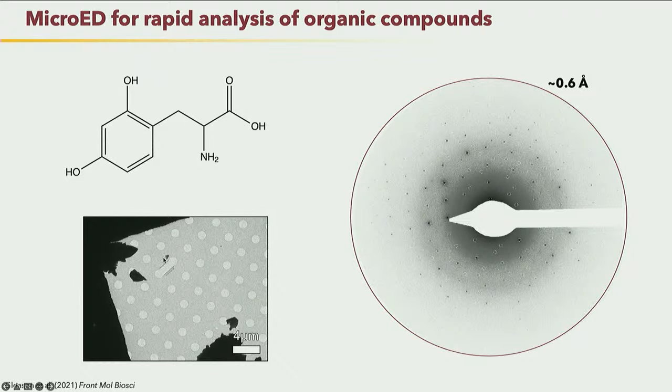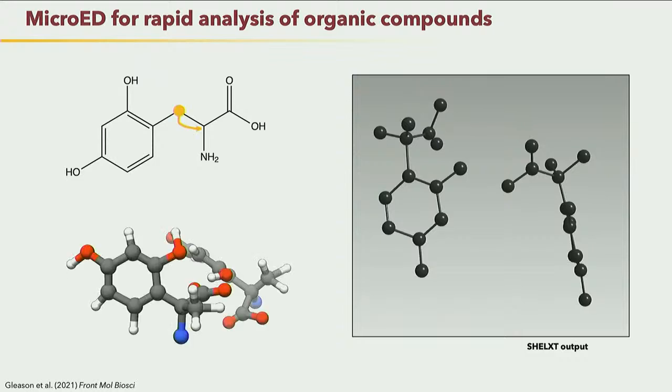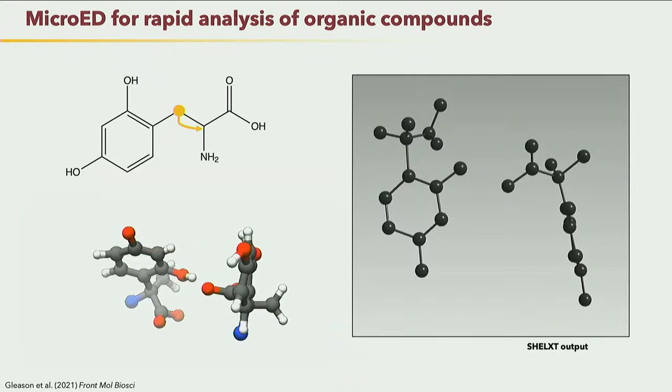We shoot these little guys, and we get really high diffraction. Spend maybe 20 minutes collecting 5 data sets, and then immediately transfer the data to my computer, run it through SHELXT. We get this as the output, build the model, change the atoms, do some refinement, and we end up getting a structure. From start to finish, it was about 2 hours.